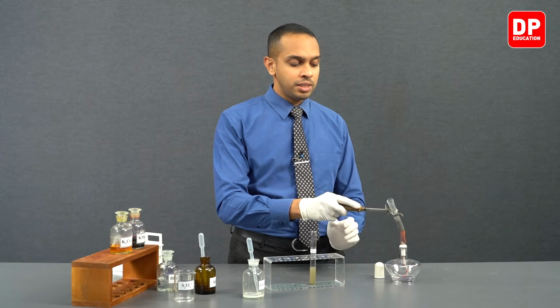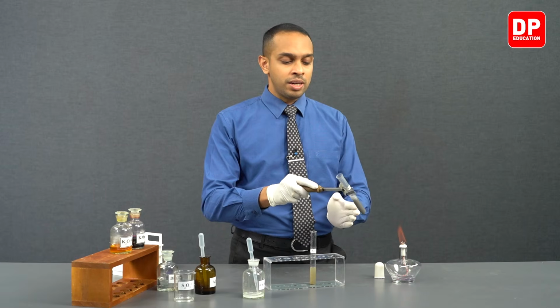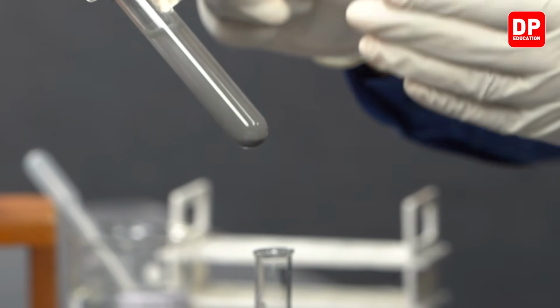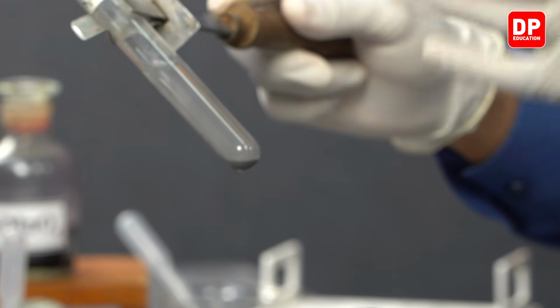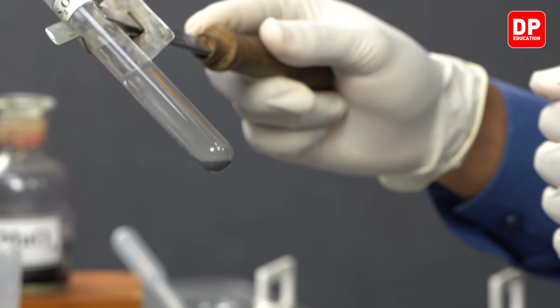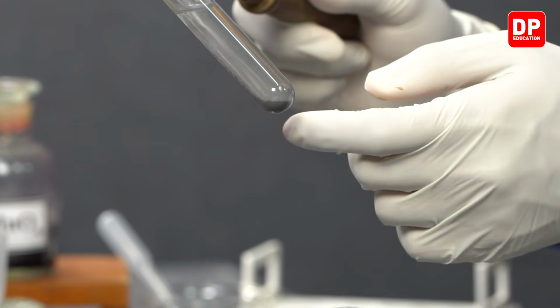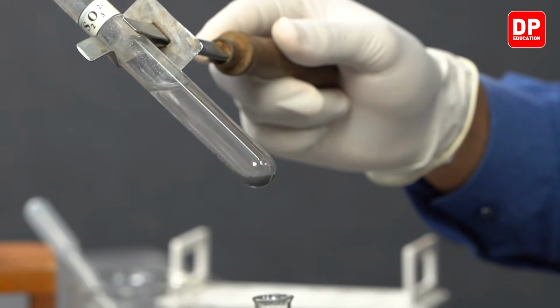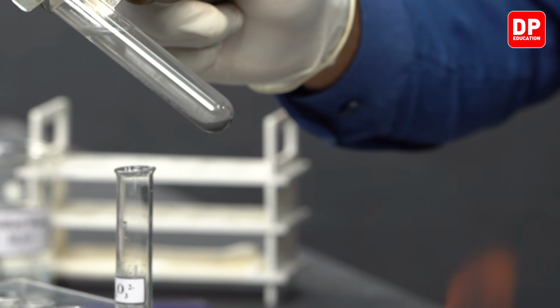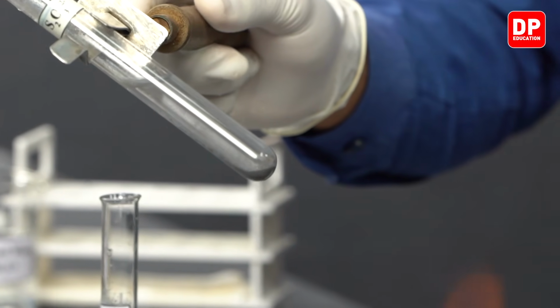If you keep on heating this, you can see very clearly the color gets darker and darker and moves towards a black color, and once all of the lead thiosulfate is converted into lead sulfide, you will observe a black color precipitate. Right now, what you observe here is a dark gray color precipitate. You can very clearly observe it as I bring this test tube to our spirit burner here.